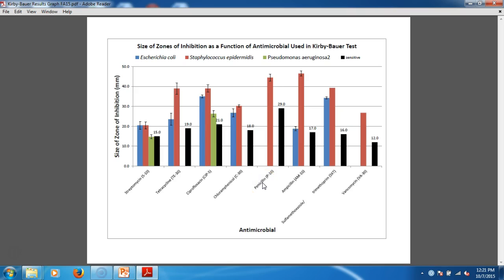I don't remember, did I write it on your guys' chart? What does it say for vancomycin? How does that work? Peptidoglycan synthesis. So it makes sense that the gram negatives are resistant to that.